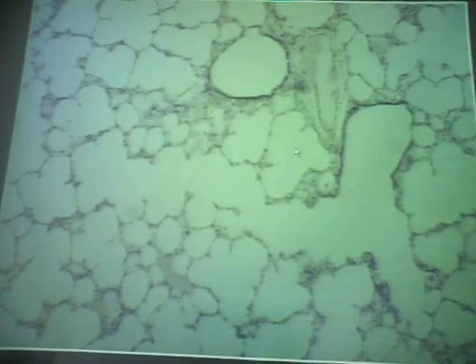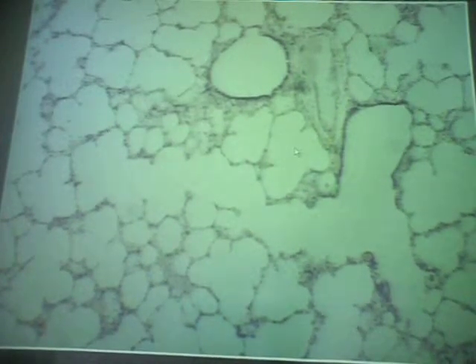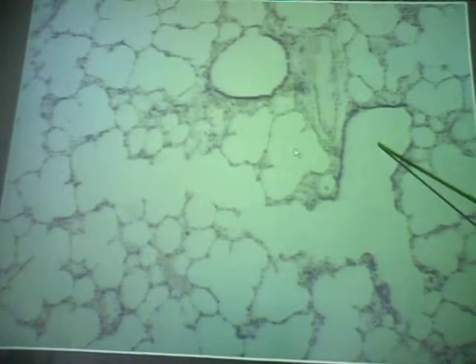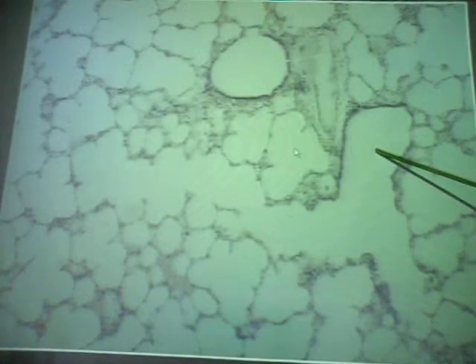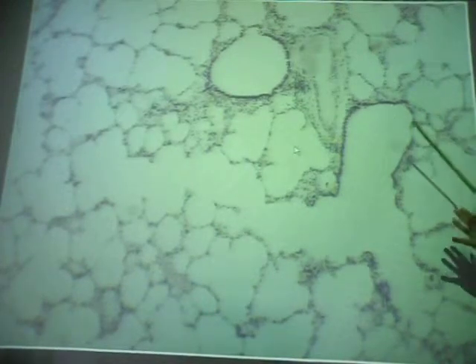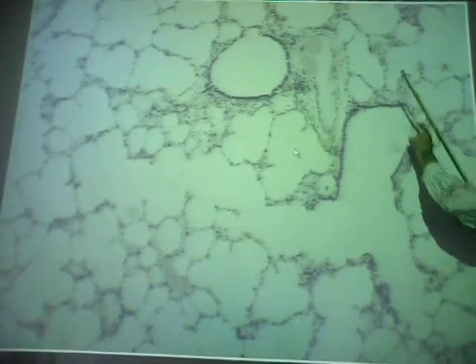Okay. This, by the way, is another blood vessel. What did you call that T-shaped passageway right there again? This thing right here? Respiratory. What should you call it? Let me put it that way. What is this? Respiratory. This one happens to be cut in a longitudinal section, so it's longer, but here's the dead giveaway. Right here, you got an alveolus, you got another one over here.